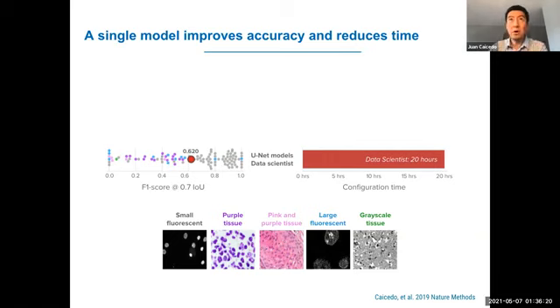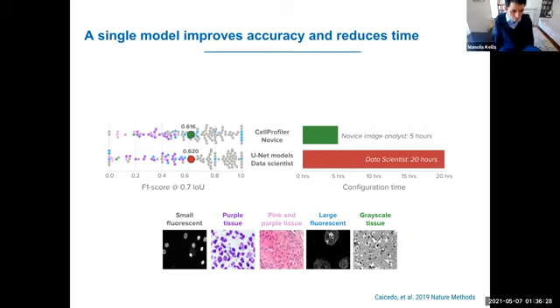Training one model per image type is one possibility. Another possibility that you can do is just segment the images using classical algorithms. And in this case, you basically have to download an image segmentation tool and then configure the parameters. There are multiple things that you can use. And this person is going to spend less time because it's just adjusting parameters, but is going to get pretty much the same accuracy as well. Same type of problems. Some images are harder to segment, and this is just classical algorithms without having to do any training or any optimization.